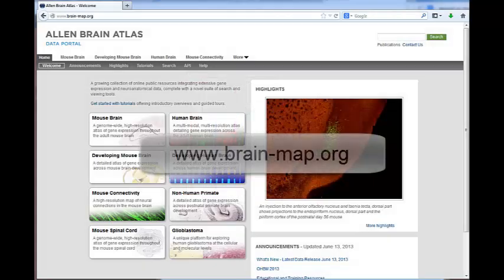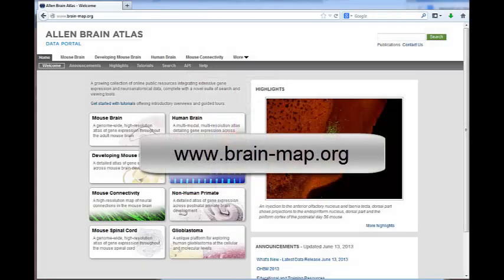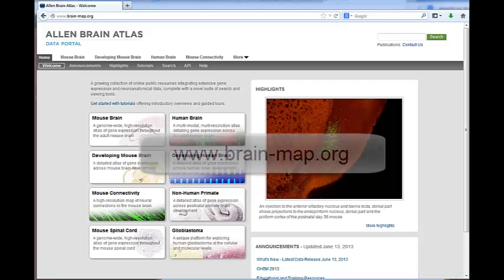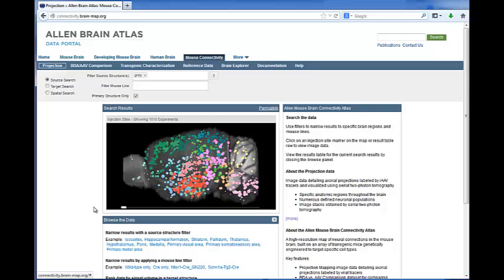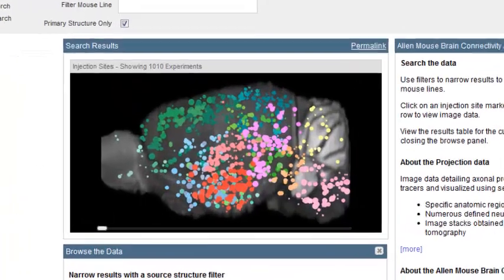From our portal page at www.brain-map.org, you can reach the connectivity atlas from the mouse connectivity button. From this landing page, you have access to browse the experiments.